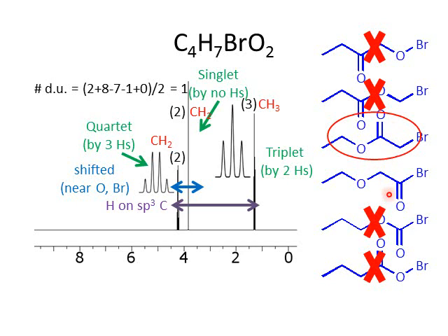So like I said, either of these is a pretty good answer, but this one turns out to be best. If it was this, I really would expect this particular singlet to be more like 4.7 or maybe even almost 5. I don't know exactly where it would be. I'd have to look. Also, if it was this, it would be a much less stable molecule, and that would be a bit of a giveaway as well.